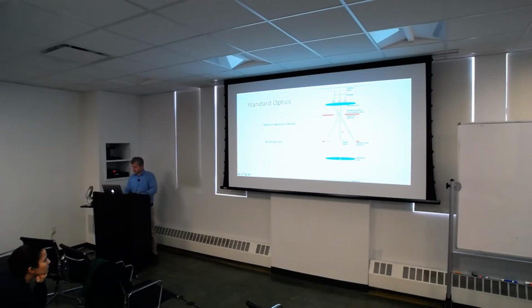That then gets reconstructed into a real image, and is magnified by the projection lenses to form a much magnified image at the very bottom. This is the standard technique that we're all using in EM for regular imaging, in a slightly simplified diagram. What's important is that in the objective plane, you usually have an objective aperture inserted, so that you're getting rid of the most highly scattered beams.